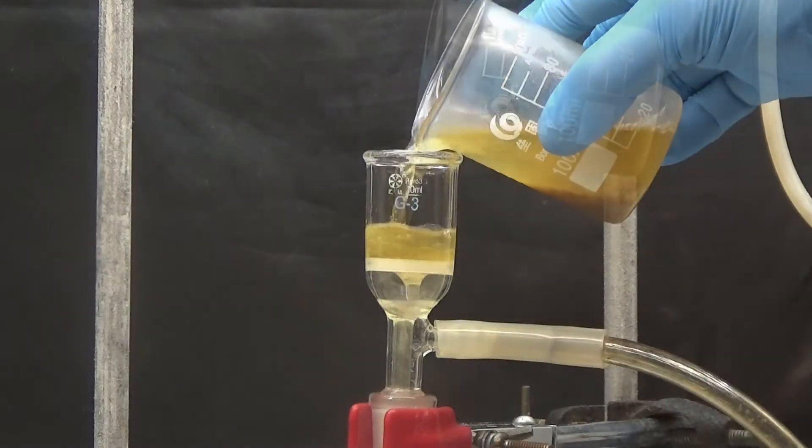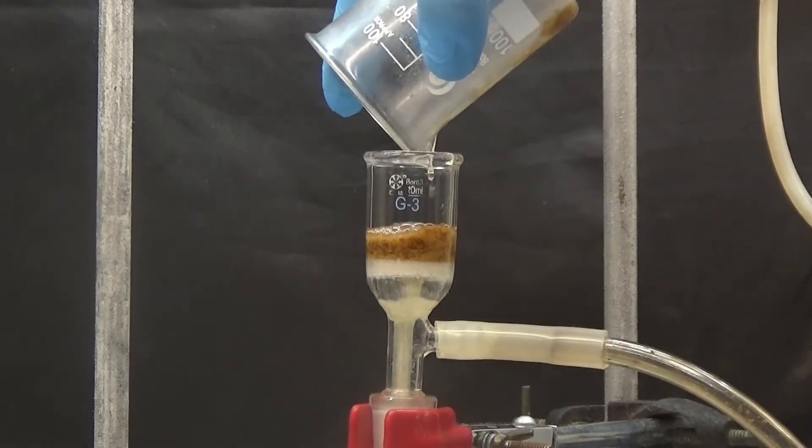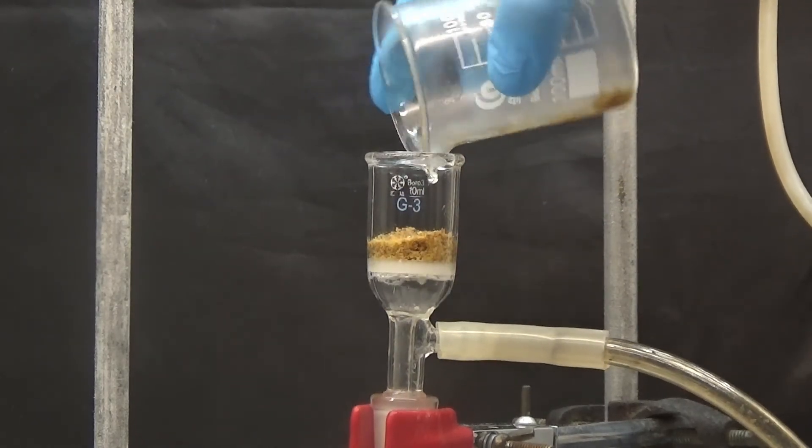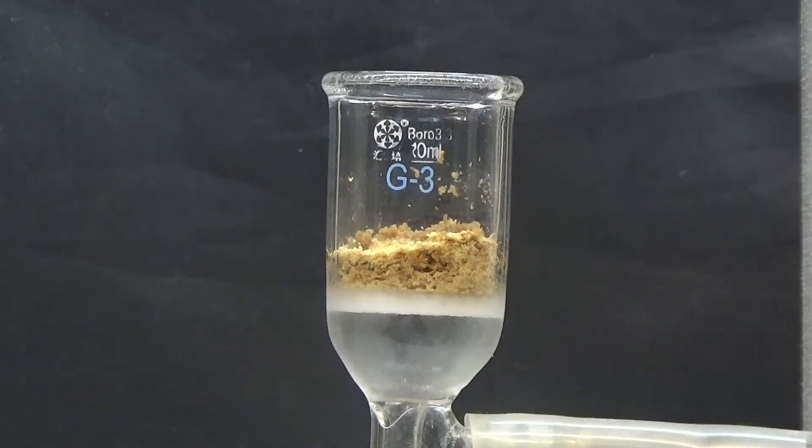The toluene extraction was left in the refrigerator for 12 hours and the solid was collected by vacuum suction. Dry the product by suction on the filter funnel for 1 hour.